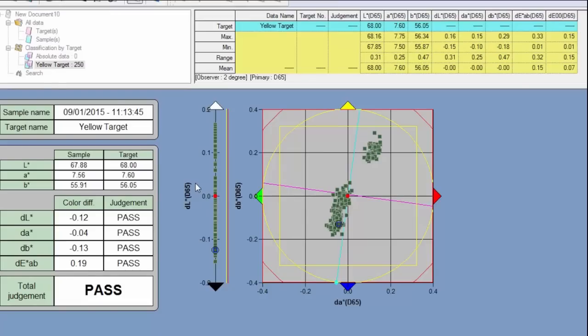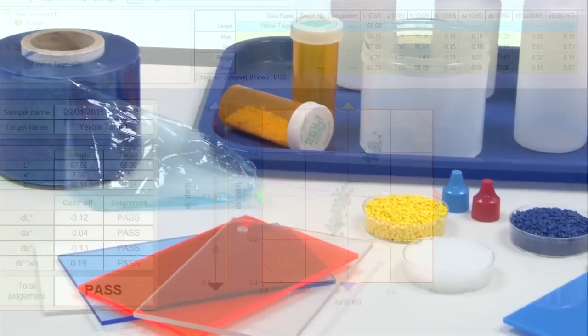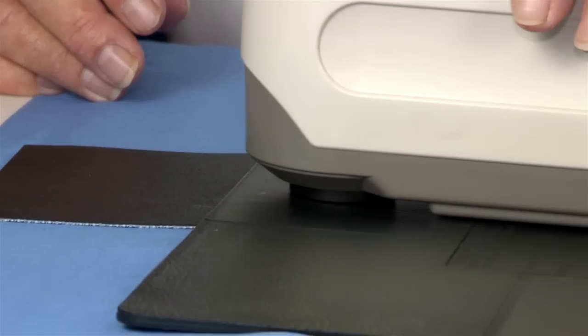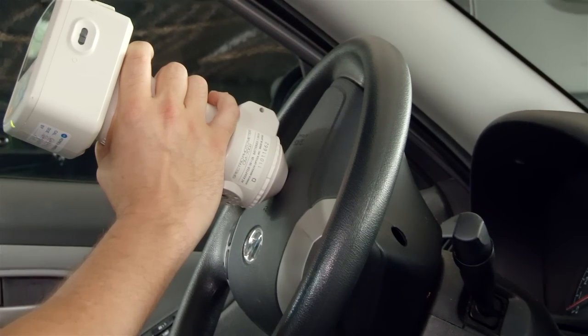With SpectraMagic NX software you can perform comprehensive color inspection, analysis of incoming raw materials, in-process production, and outbound color-critical goods and materials in virtually any industry.